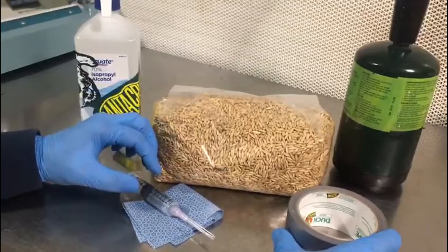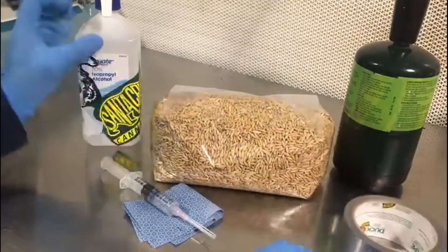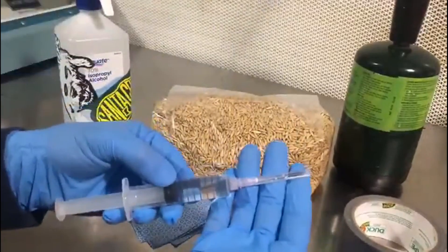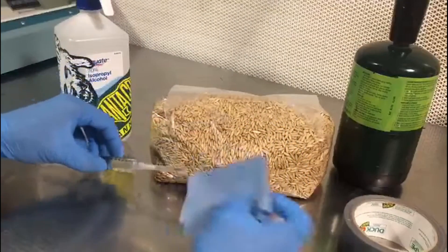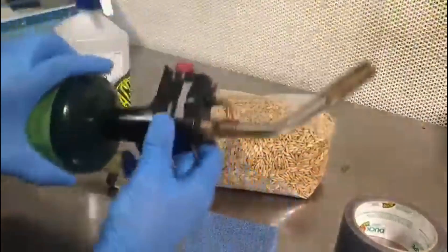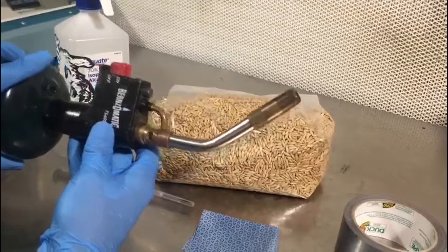Some of the things you're going to be needing to get this done is some duct tape, isopropyl alcohol, your syringe and needle, something to wipe your bag down with, and a tool to flame sterilize your needle. In our case, we're going to be using a butane torch.